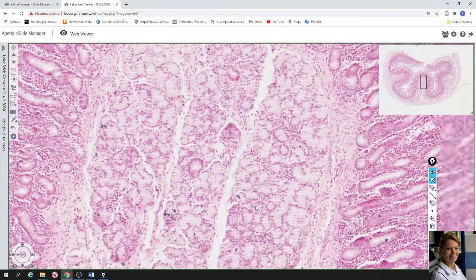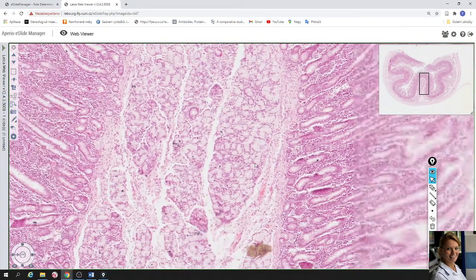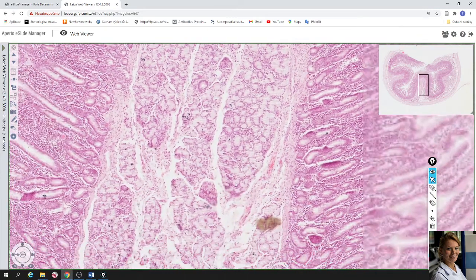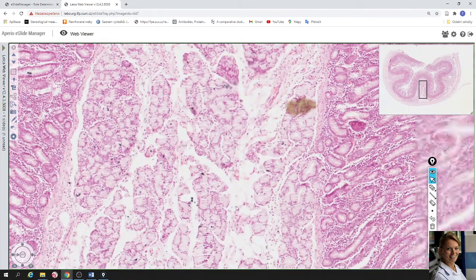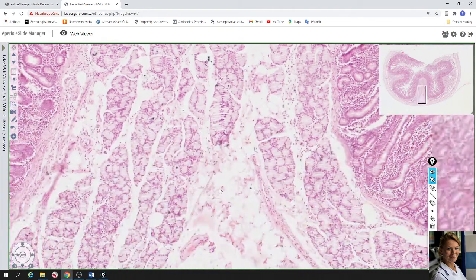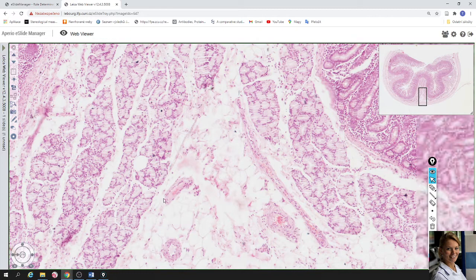The submucosa is formed by loose connective tissue and filled by mucous glands called glands of Brunner. This is the compound tubular gland that produces mucus. Also in the submucosa you can find fat cells, and blood vessels — here you can see an artery and a vein.